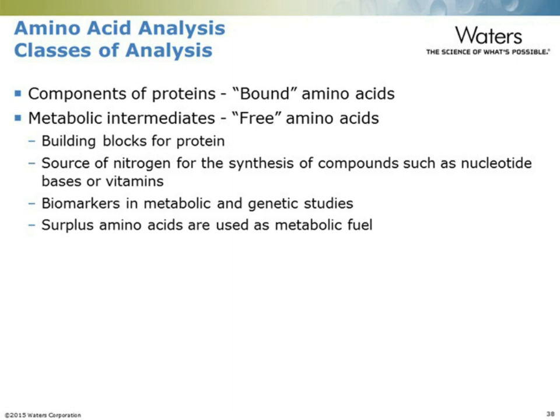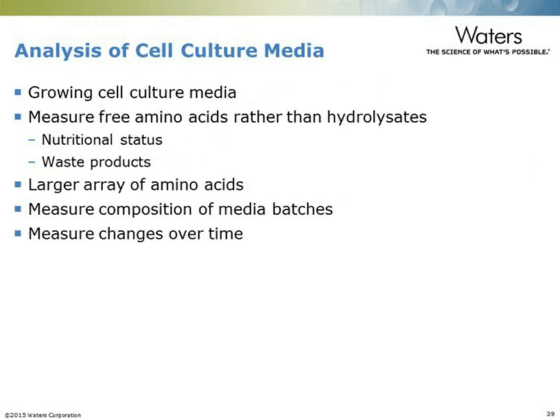One of the things that is most important is to monitor a growing cell culture media. Here, we're looking at the free amino acids both as a nutritional element that limits the growth, controls the growth of the cells, but also as a measure of the waste products being produced by the cell metabolism. In this case, we're looking at a larger set of amino acids than would be monitored in a hydrolysate.